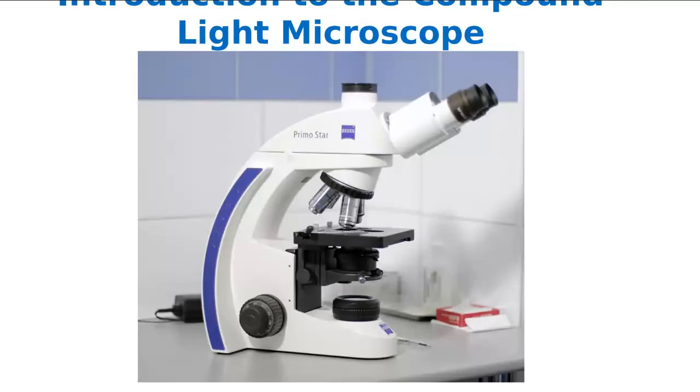So today's lab, we're going to talk about the compound microscope, and then we'll look at oil immersion, and then we're going to look at the clinically important fungi, some of them, not all of them, there's a bunch of them. But I want you to know that everything we're talking about in lab is going to be on the practical, right? So you need to find an effective mechanism to make sure that you are studying them, okay? And that you understand them. So let's go ahead and get started.